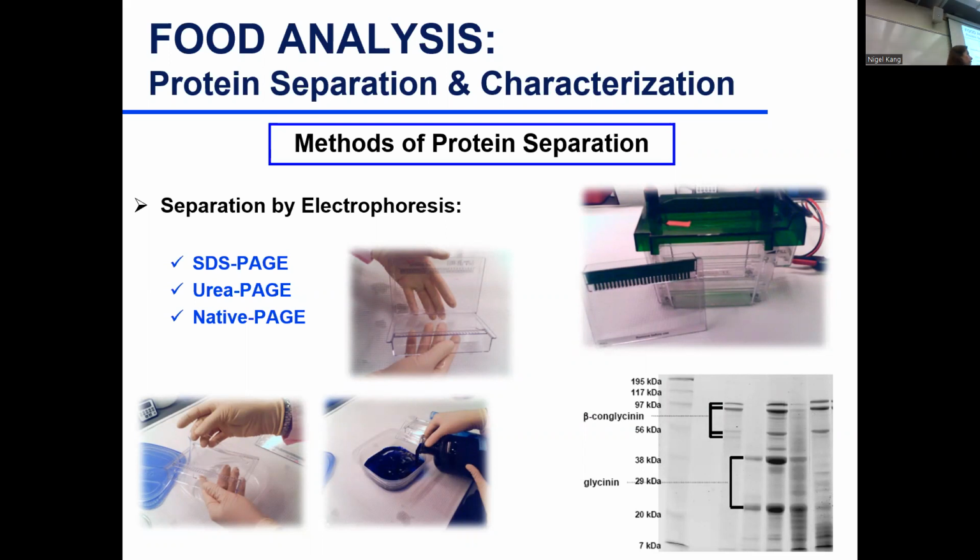So what is happening? There is no negative charge that results in repulsive forces and helps dissociation of protein subunits. Instead of different bands, we have fewer bands which are really wide, because there were no repulsive forces between the bands. Its application is more limited compared to SDS-PAGE. SDS-PAGE is more common.